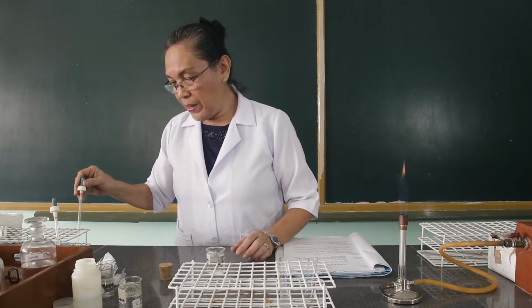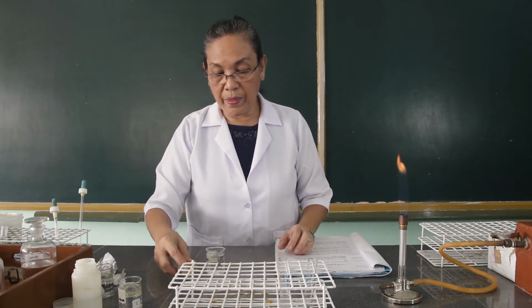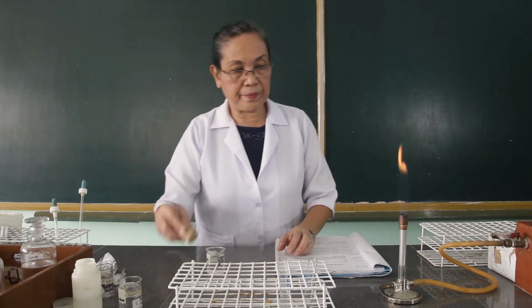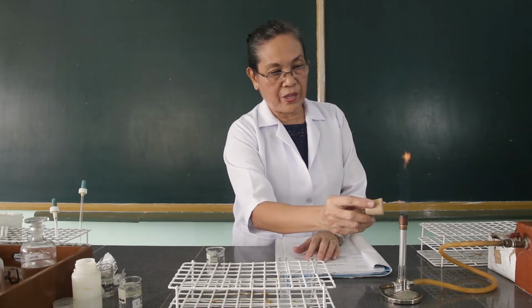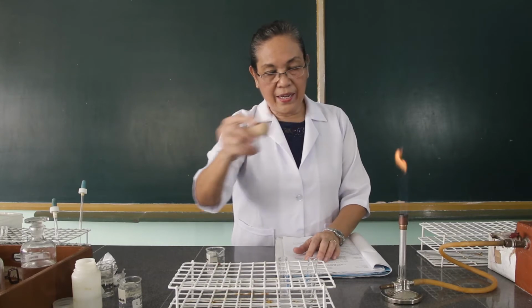Magnesium chloride. Observe what's the color imparted by magnesium ion. Let's repeat.